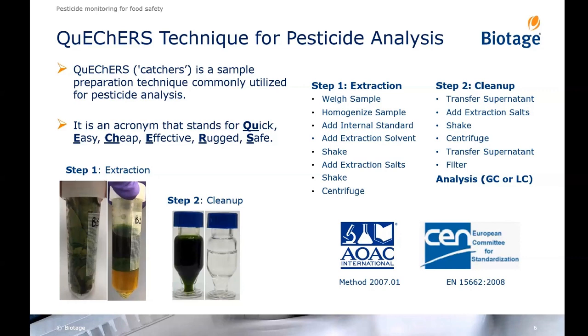And the nice thing about this technique is it's very basic and it allows us to simplify the extraction of such a complex and wide variety of matrices. And in its simplest form, it has two steps. Step one is the solvent extraction, which is typically in acetonitrile.